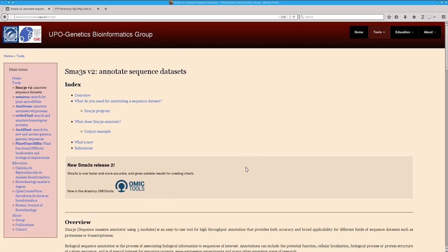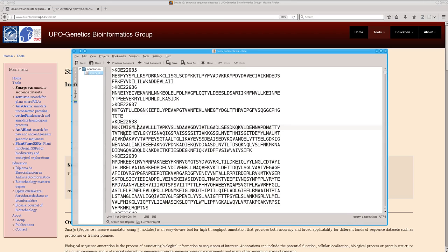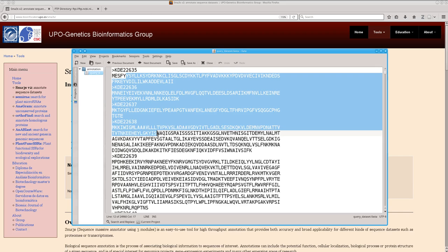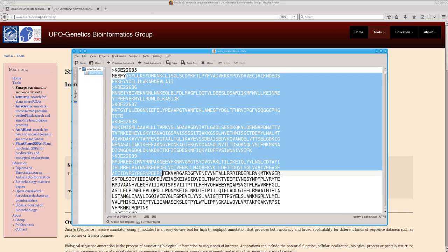Hello, this video tutorial is an introduction about how to use SMAS3s to functionally annotate large sequence datasets. First, we need a FASTA file with the query sequences to annotate. Here you have an example with the different identifiers and the amino acid sequences to annotate.